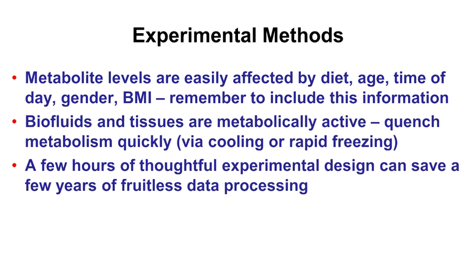You can do that by hitting them with rapid freezing. If it's a tissue and you're working with surgeons or a vet or someone like that, or even a plant, freeze it quickly. Liquid nitrogen is usually the best. If you can't get that, get at least dry ice and methanol. If you can't or won't freeze things, then you can kill bacteria by adding things like sodium azide or EDTA. And again, that prevents a lot of the activity.